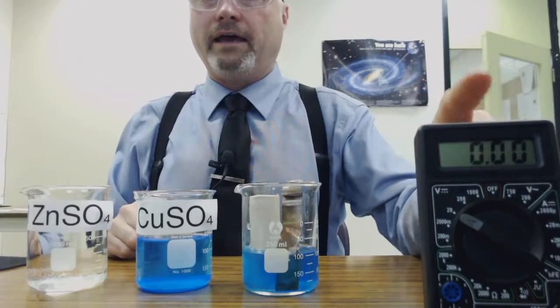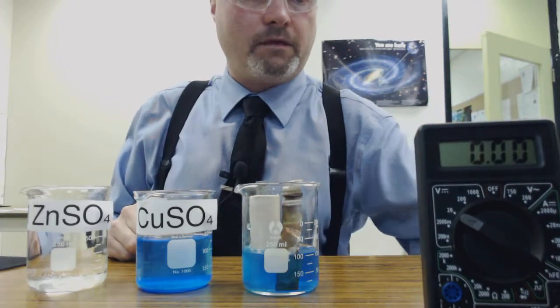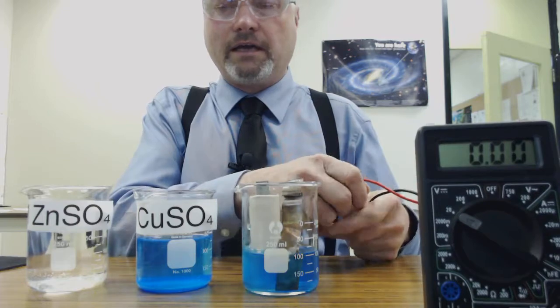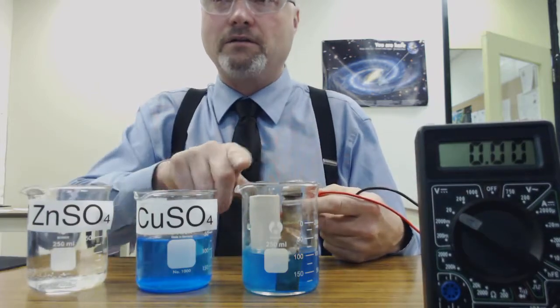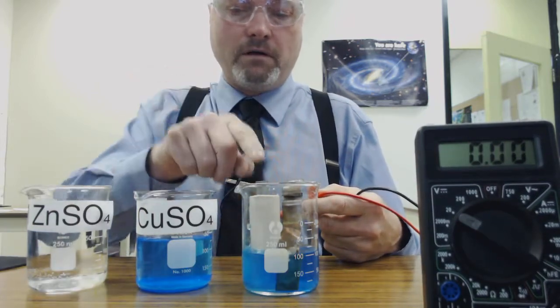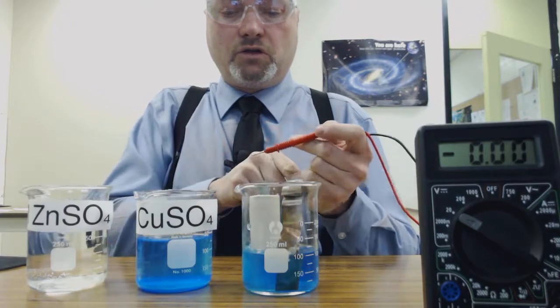So we have a voltmeter right here and what we are going to do is we are going to show that there is a potential difference. In other words, electrons are going to be flowing from the zinc to the copper.